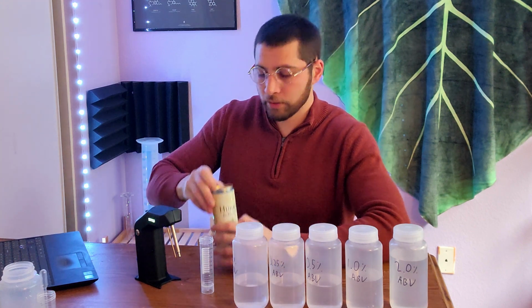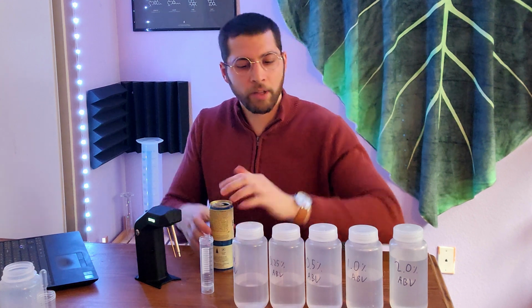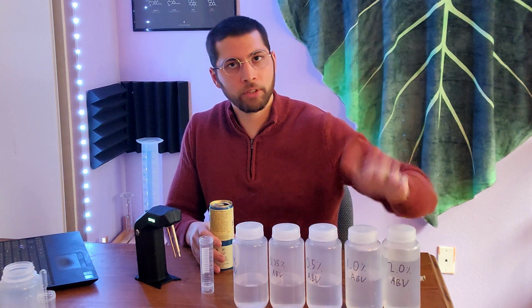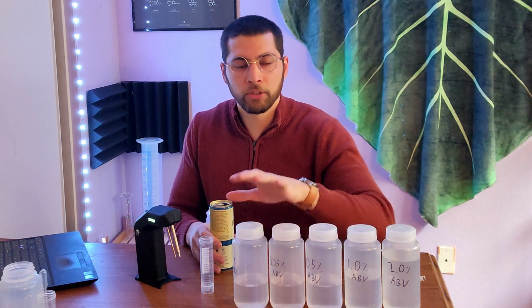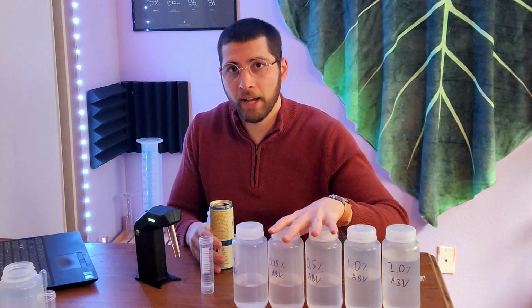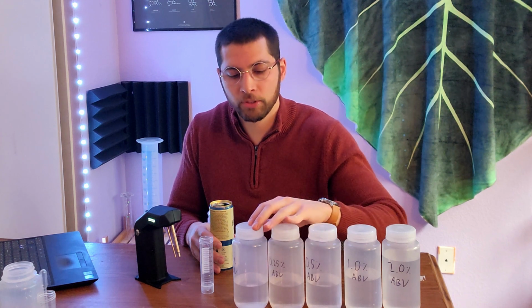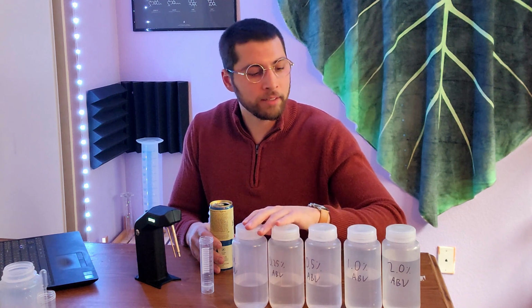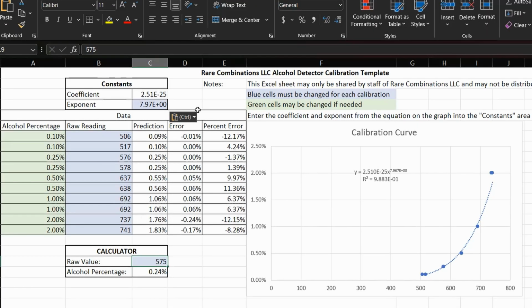I have a brand new thing of kombucha. I just made a calibration curve with these samples here. You can go watch that video on the channel. But basically, you measure known alcohol standards. You don't have to buy these from me. This is just diluted vodka. That's it. You can make them yourself very easily. I tested 0.1 to 2%, and you can see that calibration curve here.